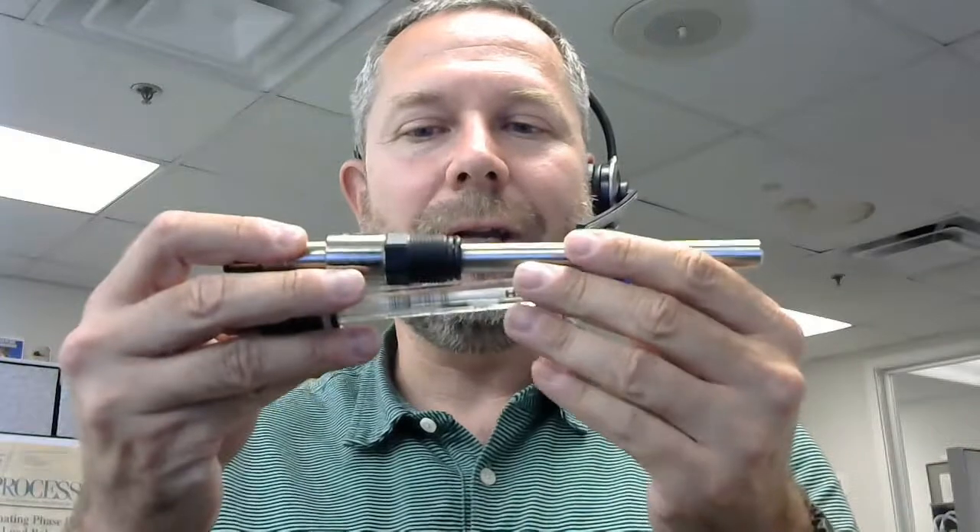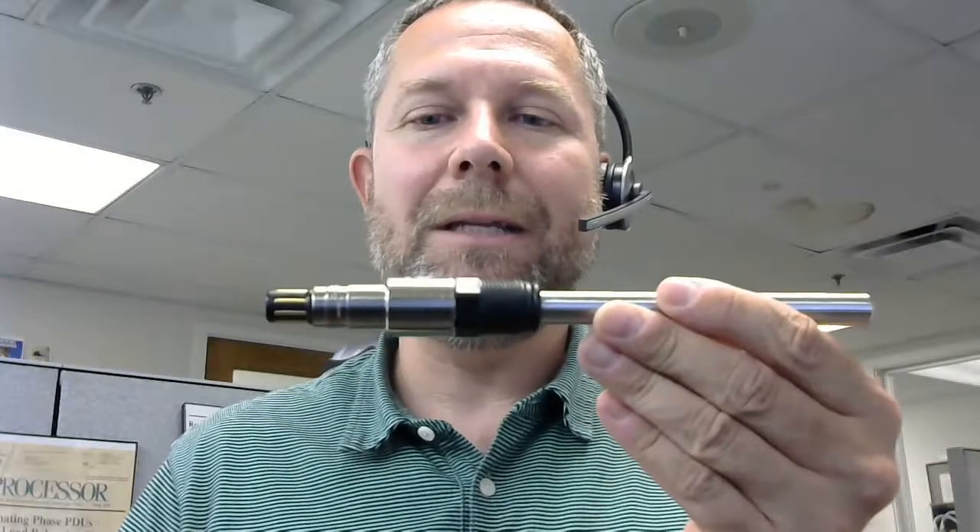Hello. In this video, we're going to take a little look at sensors, sensor connections, how they get installed, and how cables get attached to sensors. I've got a couple sensors right here, and let's take a look at the anatomy of the sensor.